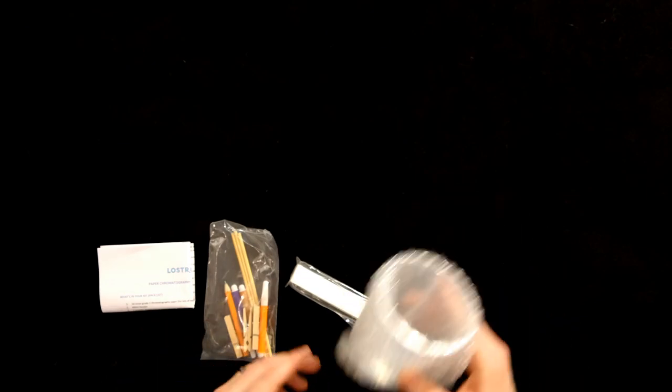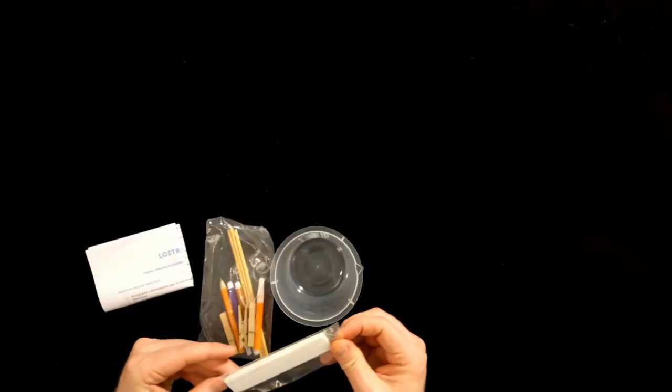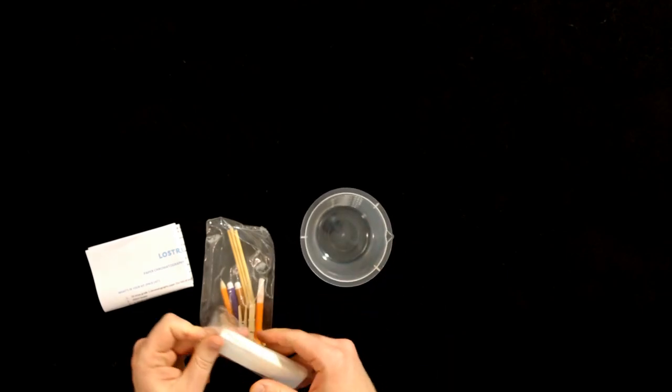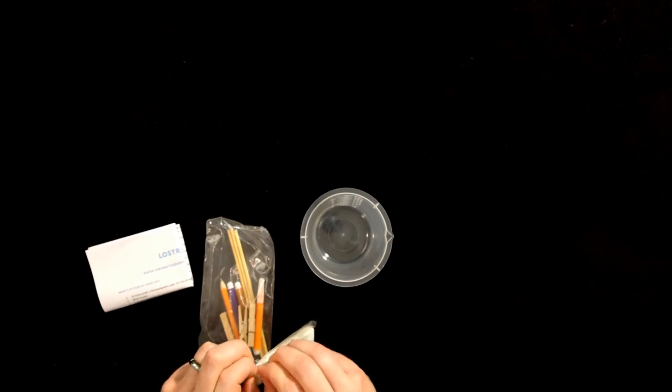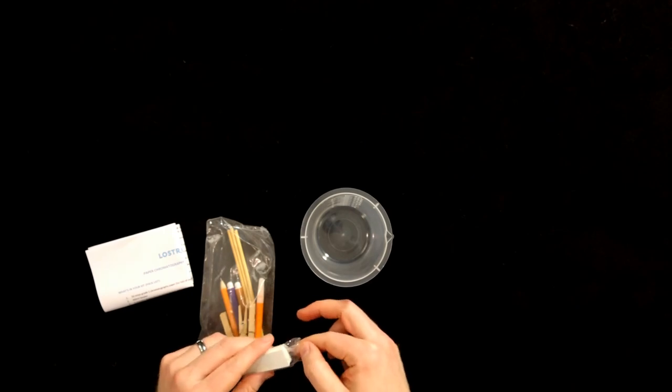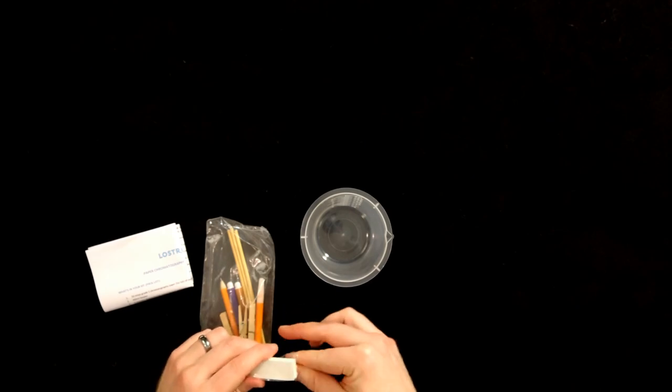Now not all chromatography is done with paper. More advanced chromatography is accomplished on things like a gas chromatograph or a liquid chromatograph. These use flowing liquids through a column, or flowing gas through a column, which is basically just a tube, to separate things flowing within that stream. In the case of paper chromatography like this, a strip of paper acts like the column, and liquid wicking up through the paper is going to act as what is called the liquid phase, or the mobile phase in this case.